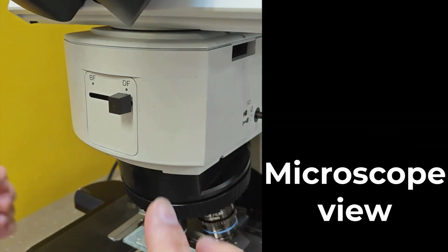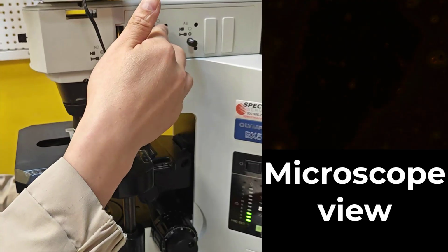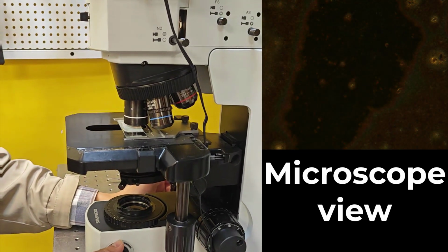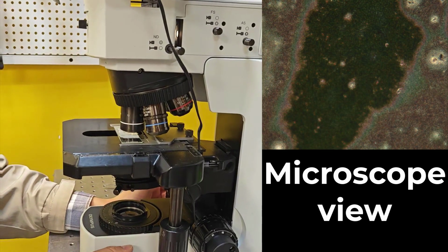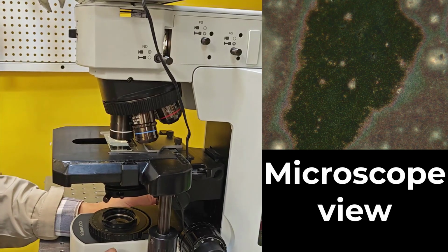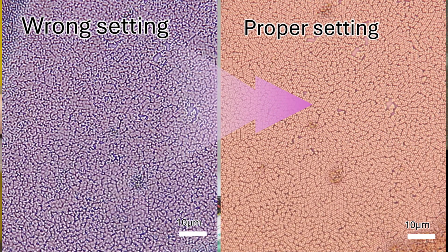However, when you switch from bright field to dark field, you must fully open the field stop as you are imaging with the scattering light. This is how we properly align the microscope, getting the best image. Hope this is useful. Thank you.